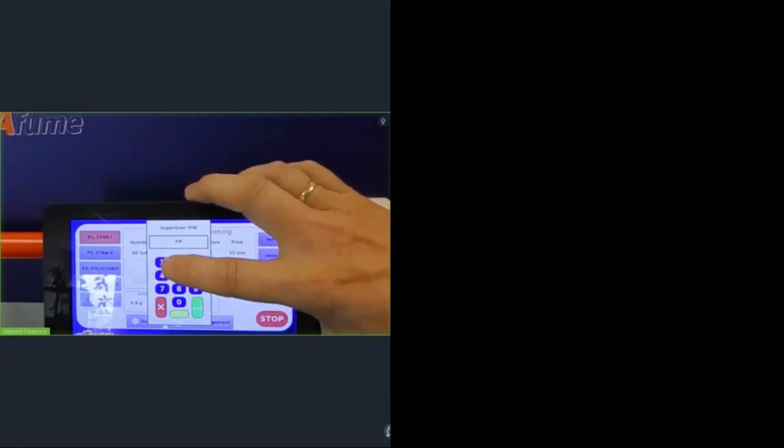Back to the settings menu. If I have replaced my filter, the system asks me, are you sure? This is a bit dangerous. If you do something wrong there, you must be authorized. So it asks me for the PIN. The factory default is 1, 2, 3, 4. And when you do that, you actually go into a menu where you could select what glue you have been using on there or what parameters you're using there.